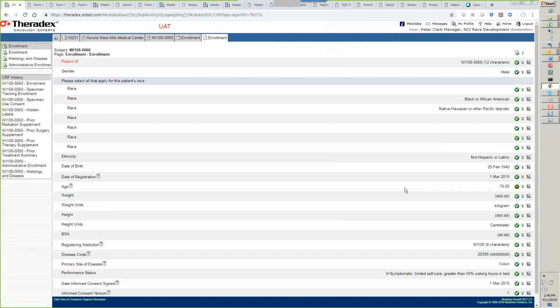Let's see, here it is, date of birth. Okay. Chris, you can have date of birth on a clinical report as long as you can't correlate that to a specific individual. You can't have a name, but if you have just the internal number plus a date of birth, nobody's going to be able to figure that out unless they go back and try to get the census information for everybody who was born on that day. So that's pretty impractical.